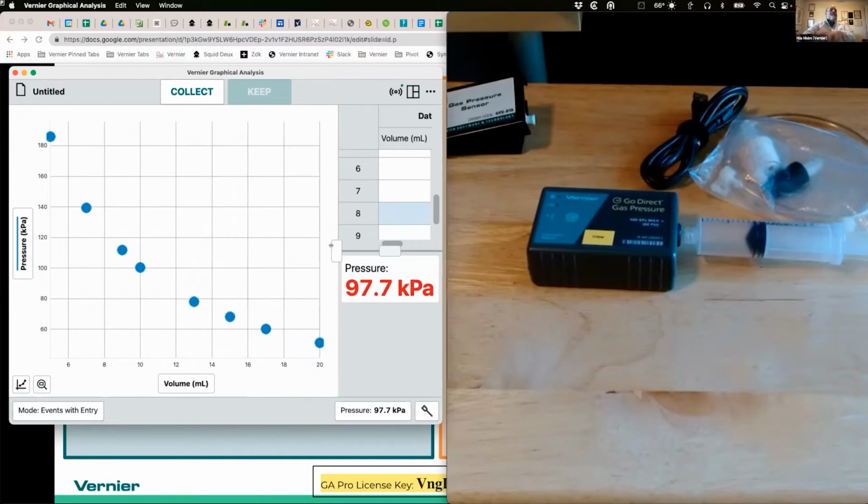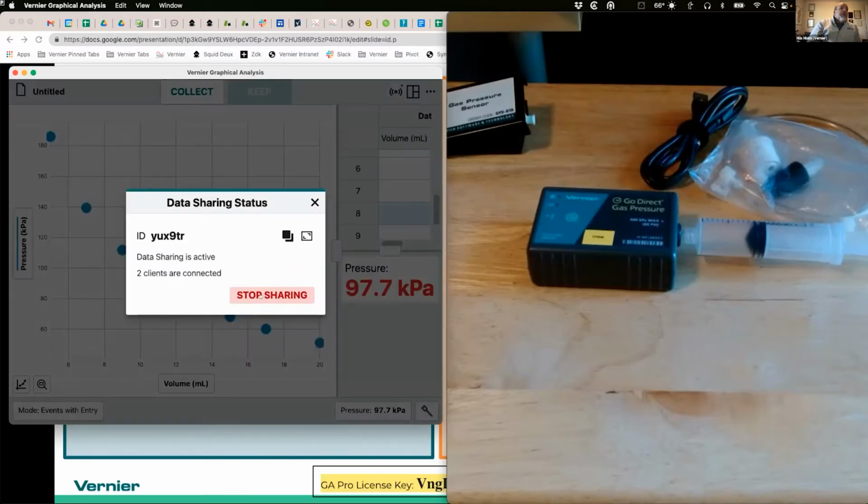All right. Now I want to give you an opportunity to try the data analysis with me. So I'm going to disconnect from you guys. Anyone that's connected to me, I'm going to go up here and stop sharing, because I want you to experience some of the analysis options.